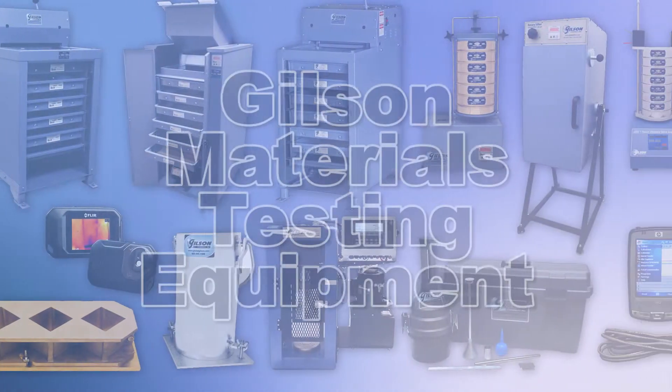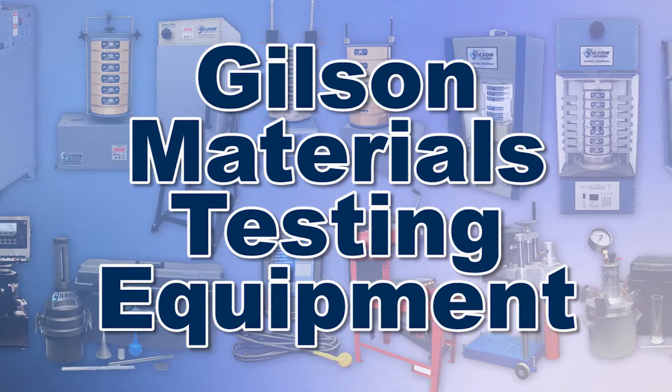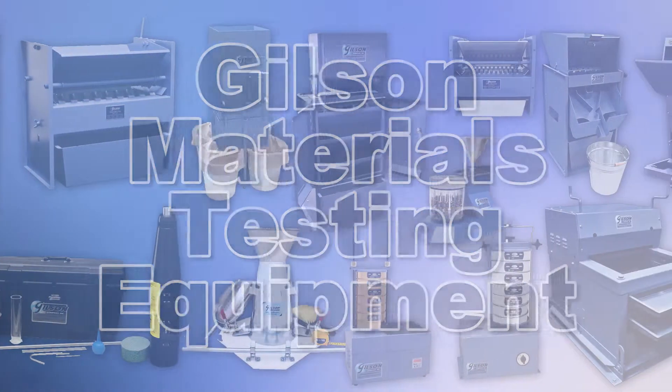With Gilson's complete family of materials testing equipment, offering a wide range of performance, features, and capacity, Gilson has the right equipment to fit your needs for fast, accurate, and reliable materials testing.